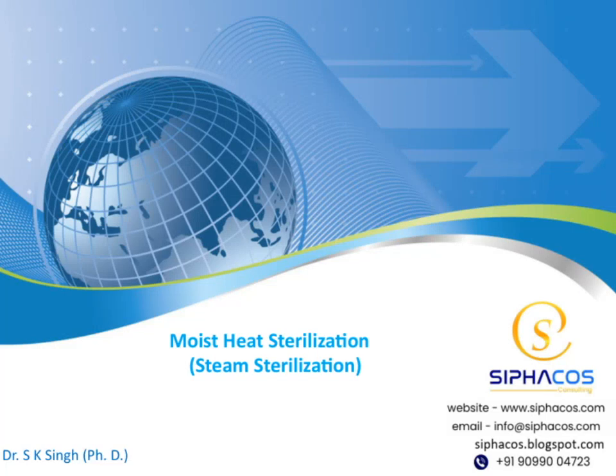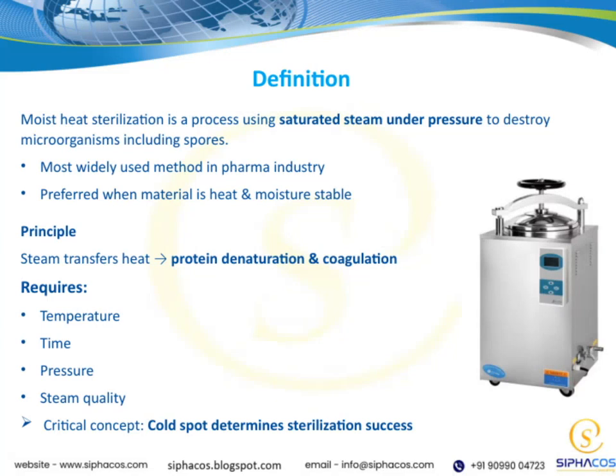I'm Dr. S.K. Singh, and I'm excited to share with you some insights on moist heat sterilization, specifically steam sterilization. In this session, we'll explore how this method is used to ensure safety and sterility in various settings. We'll cover the principles, procedures, and key considerations for effective sterilization. Let's get started. Let's start by understanding what moist heat sterilization actually is.